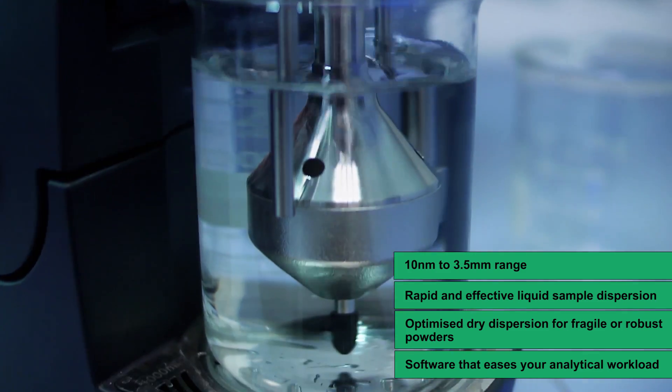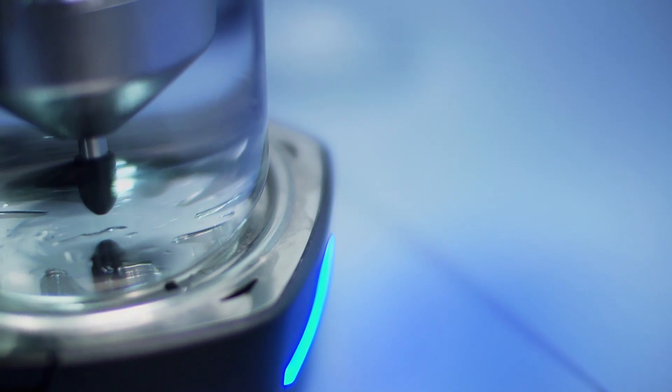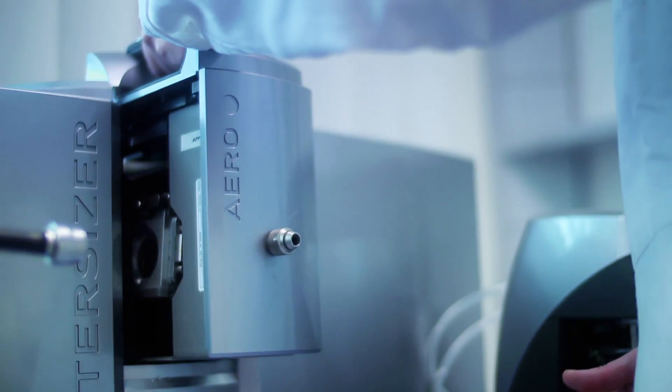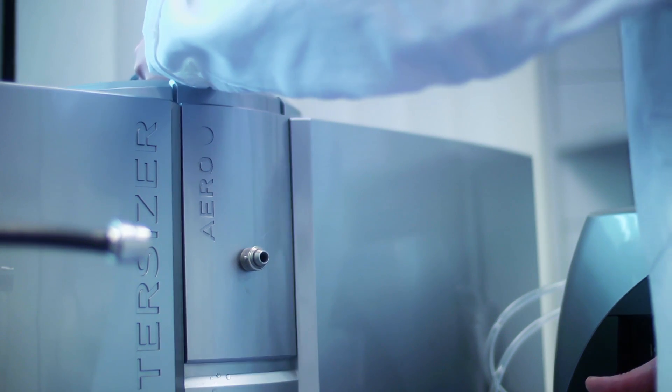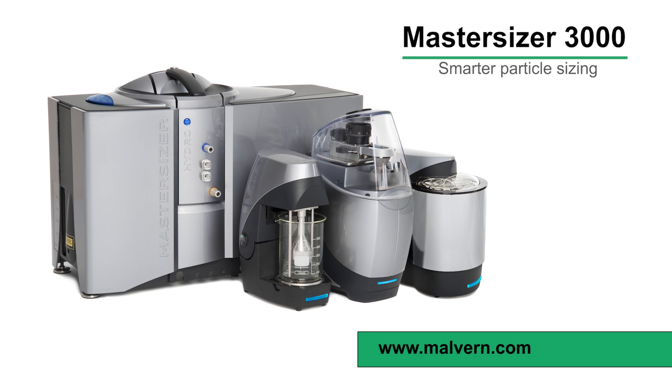Delivering robust measurements independent of whether you're a materials characterization expert or new to particle size measurement, it truly represents smarter particle sizing. For more information, please visit Malvern.com.